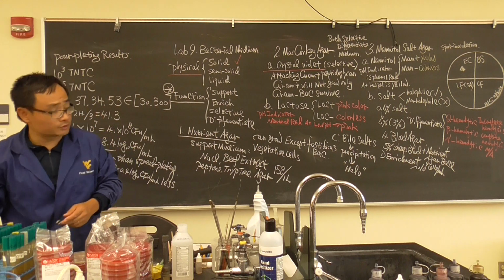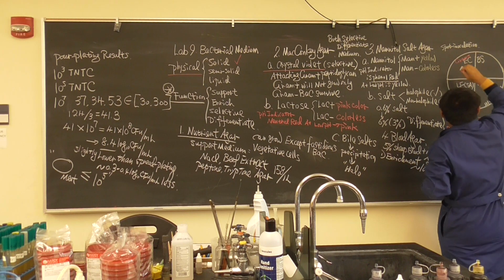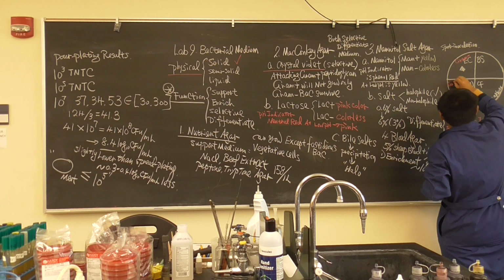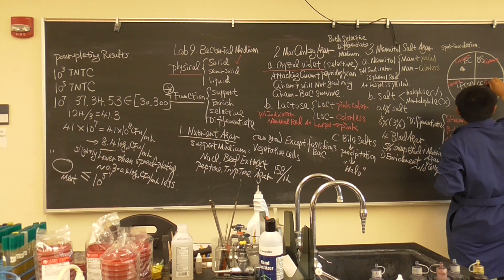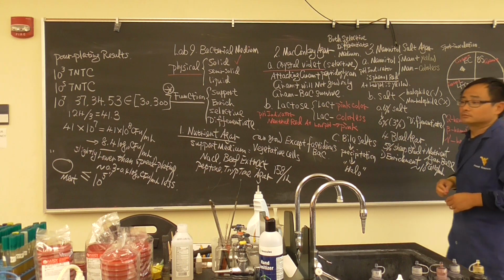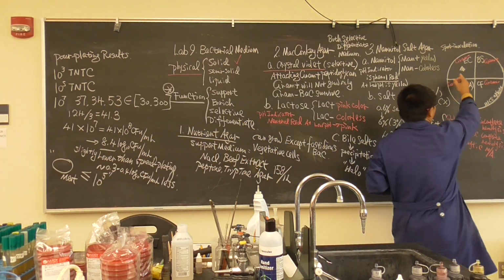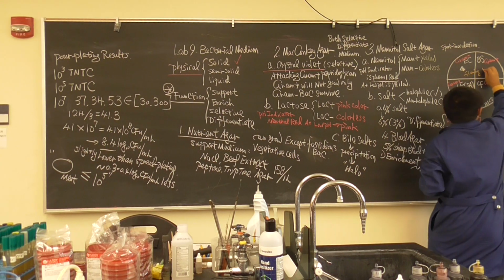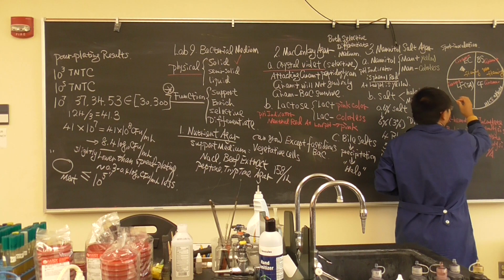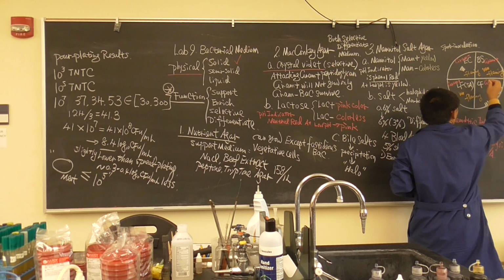I can tell you one thing: E. coli is gram-negative. So-called Lactobacillus is gram-positive. Bacillus subtilis is gram-positive. Citrobacter is gram-negative. After doing this, you use the loop to inoculate. Let's say E. coli you already did. Flaming. Then you pick Bacillus, streak. Then you flame. You pick Lactobacillus, streak. Then you flame. And finally do Citrobacter.